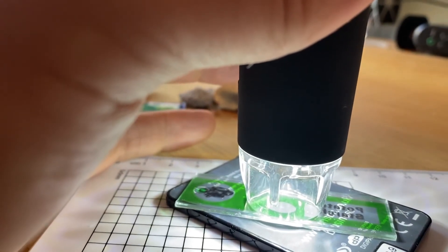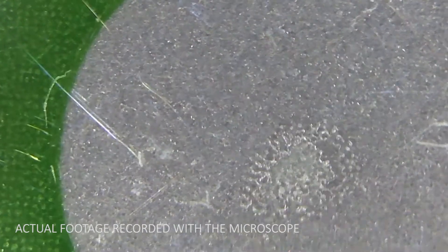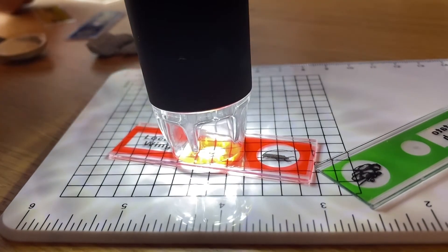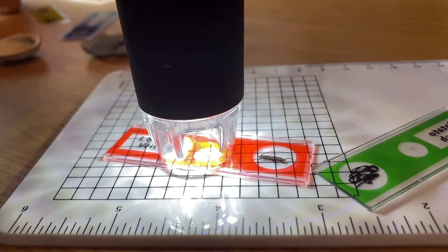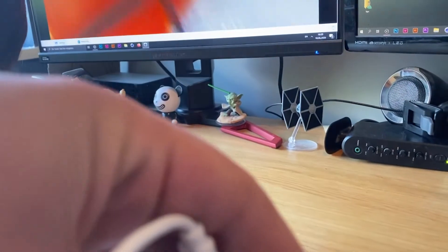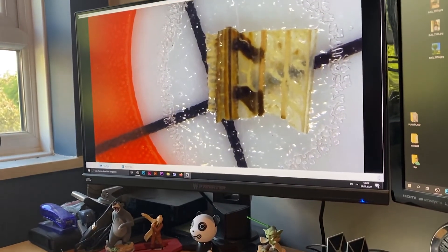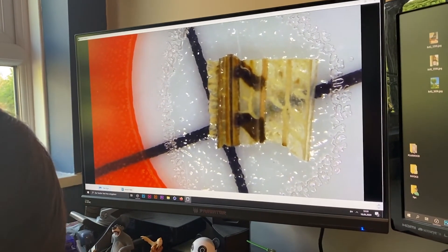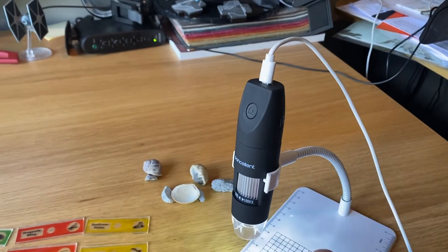Now we're looking at the potato starch, I think it is. These are the results you get with the so-called slides they give you. The locust wing is another one. The results are okay, but they are not exactly great. I found that seashells, snail shells, stones, and dirt you find in the garden — or even a dead fly — are more interesting than these slides. You're going to have a great time with things you find yourself, and the kids definitely love it.